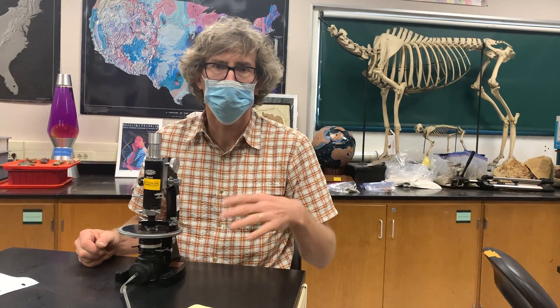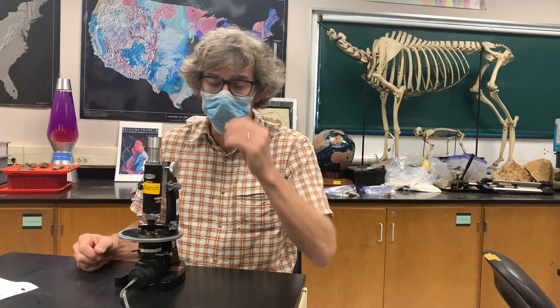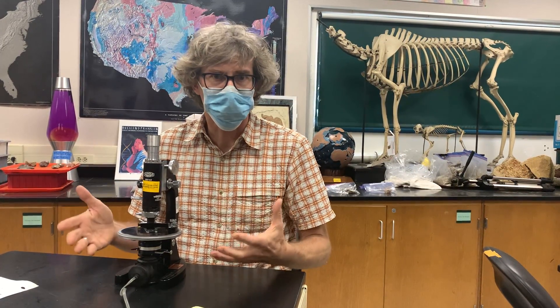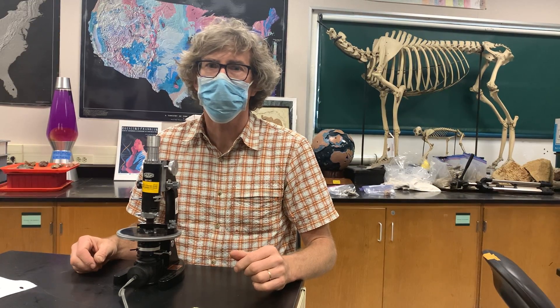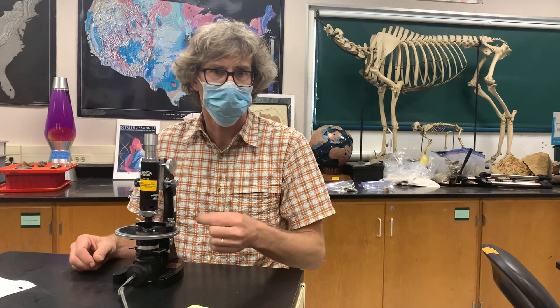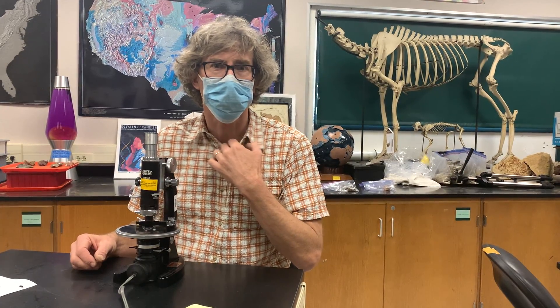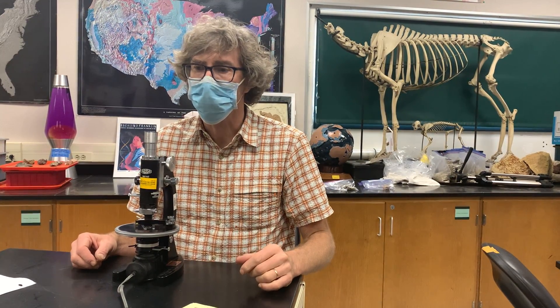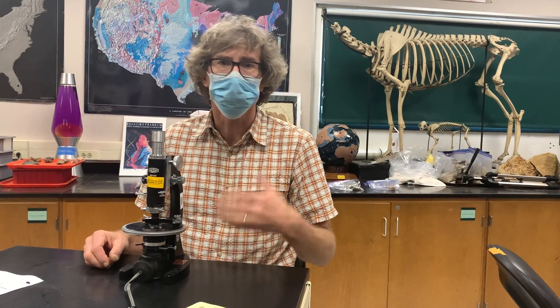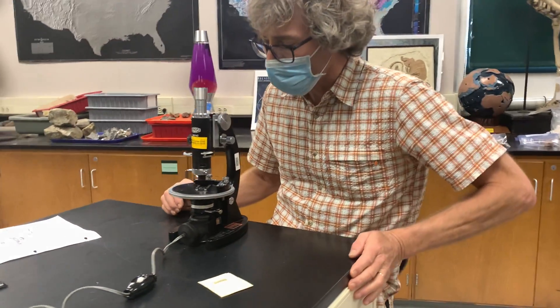I'm going to give you three videos. In this first one, I'm just going to give you an overview of what the microscope does and the principles behind it. Then I'm going to show you the details of the various parts of the microscope. And in the third video, I'm going to show you how to actually look at a thin section and what you would do to place a thin section on the stage and look at it in some different ways. So video number one is just an overview of how the microscope works.